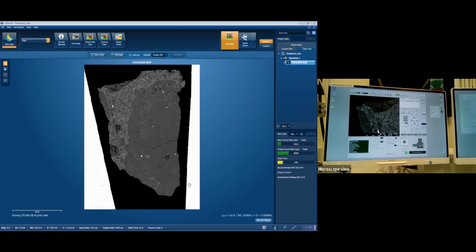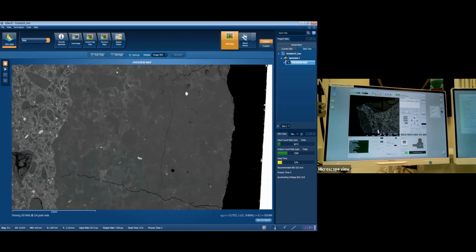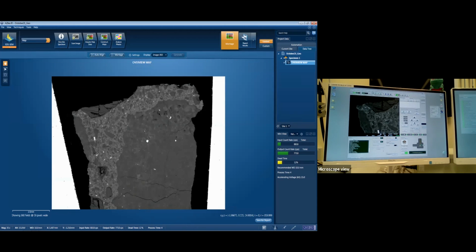So what we're going to do is, I'll zoom in a little bit. If there is something in particular you would like us to look at, you can either use the raise hand function, or you can put it in the chat and we will start looking. And if no one has any preferences, we'll just find something fun ourselves.